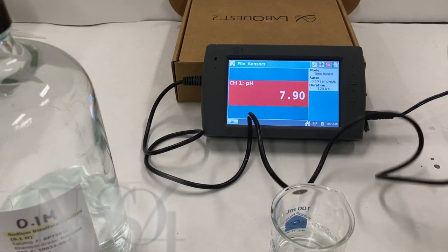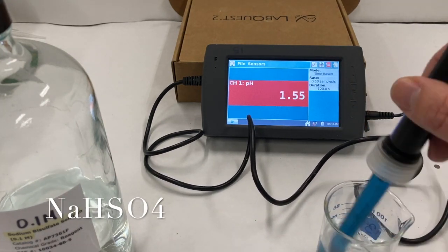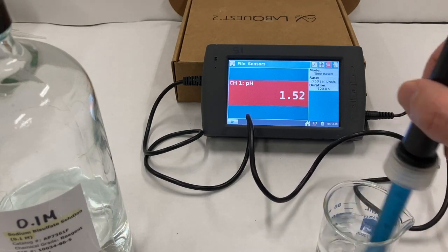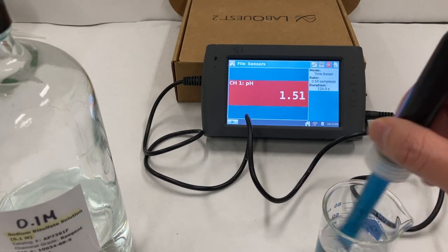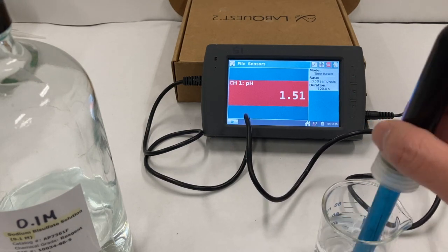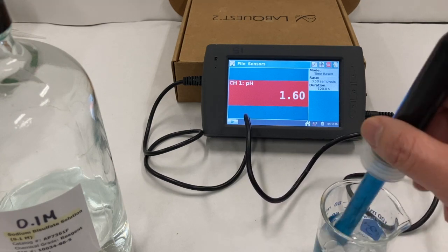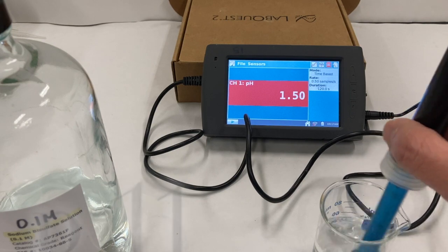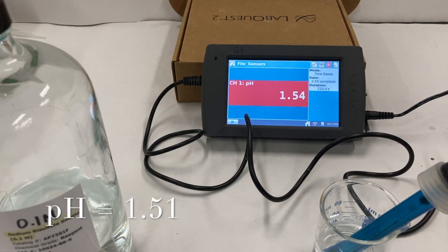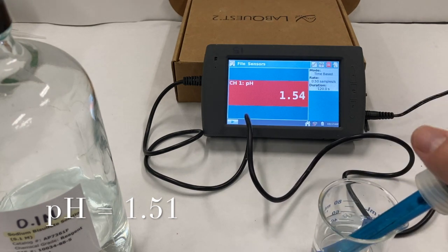Next solution, sodium bisulfate. Oof. This one could be our lowest. Seems to not want to go below 1.51. So we're going to call it 1. We'll call it 1.5. We'll call it 1.51.